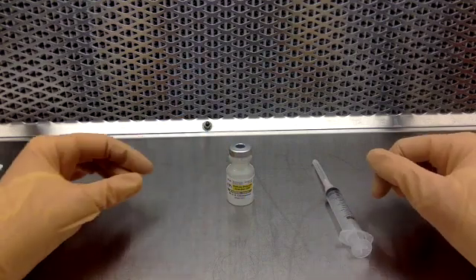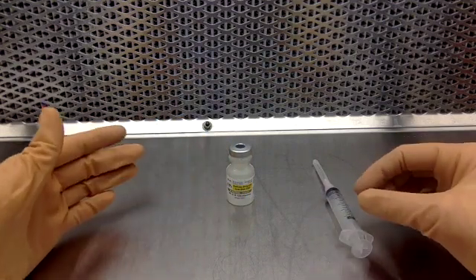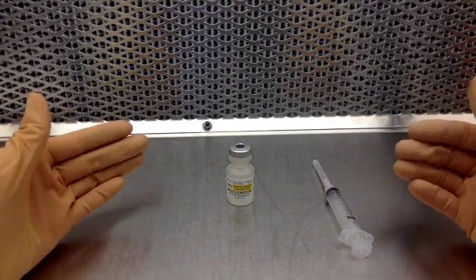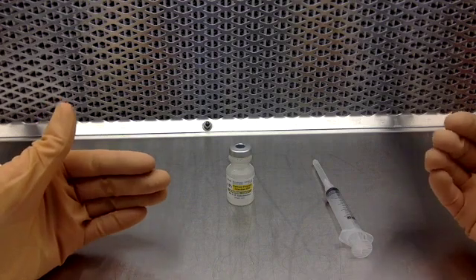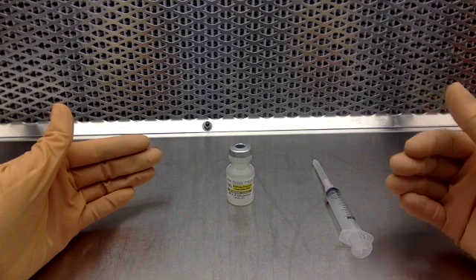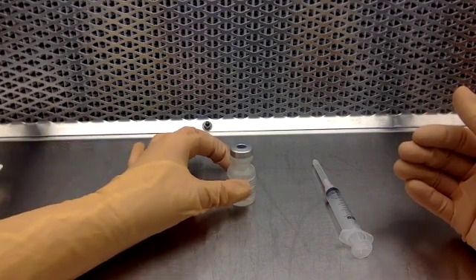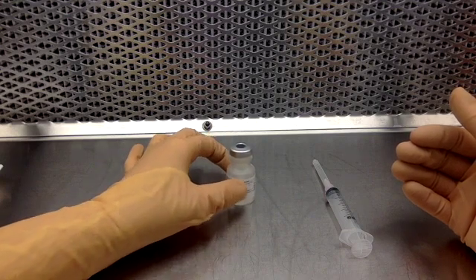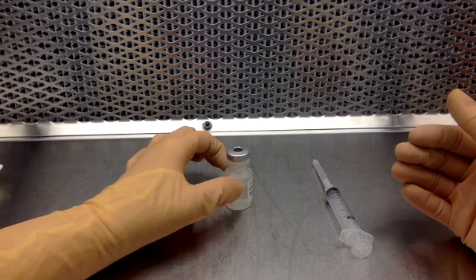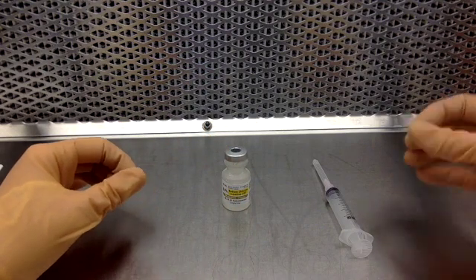When you have your vial in your hood, it is important that you have your label facing yourself. The reason why we like to have our label facing ourselves is so that as we go through the center, and then if we have to re-enter that vial, we know where we already went. So when we go north, east, south, west, I'm turning my label to the east, south, west, and then back again to have no more than 5 punctures.